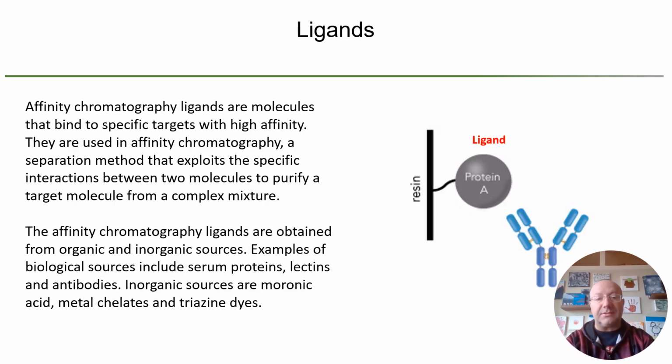Just a note about ligands. Affinity chromatography ligands bind to specific targets with high affinity. They are used in affinity chromatography, which exploits specific interactions between the two molecules. The affinity chromatography ligands are obtained from organic and inorganic sources depending on the binding properties that we're looking for.